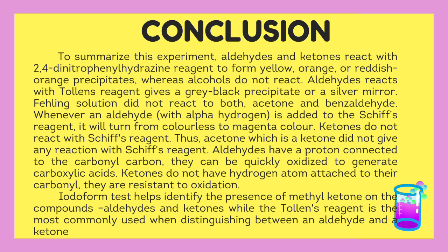For the iodoform test, it helps identify the presence of a methyl ketone in the compounds. Of the tests for aldehydes and ketones, the Tollens reagent is the most commonly used when distinguishing between an aldehyde and a ketone.